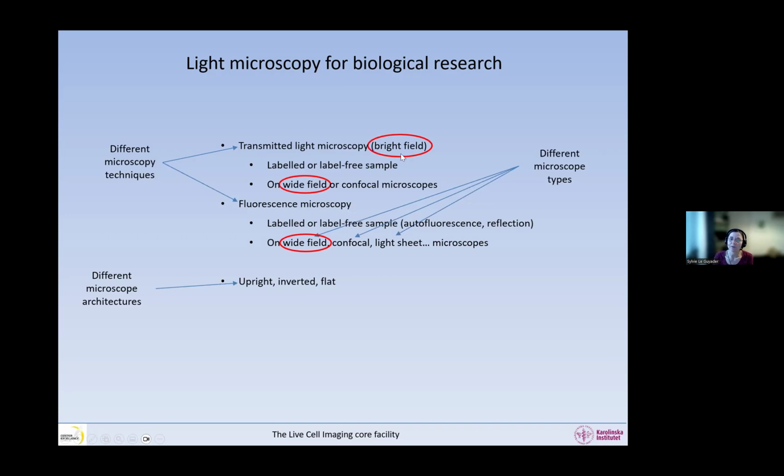Now, there is something that is already a little bit disturbing. When we speak microscopy, one of the issues comes from the fact that the words we use are not very precise. For example, when we talk about which fluorophore we use, we're not very precise there, so we need to improve. Here we can see something a bit confusing: wide field and bright field are two different things. Since I started talking about it, I want to make it very clear. Bright field means a dark object on a bright background. Bright field is one technique of transmitted light microscopy.